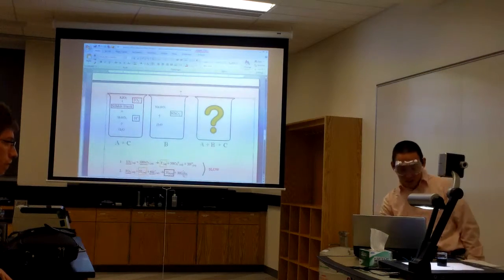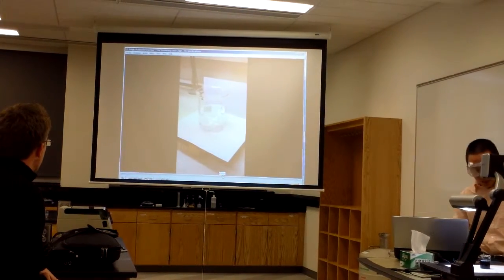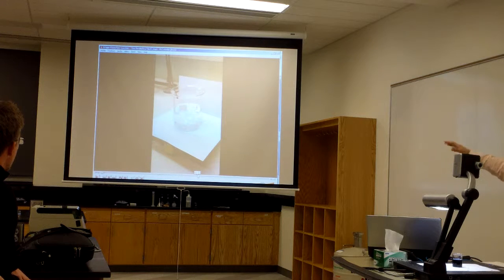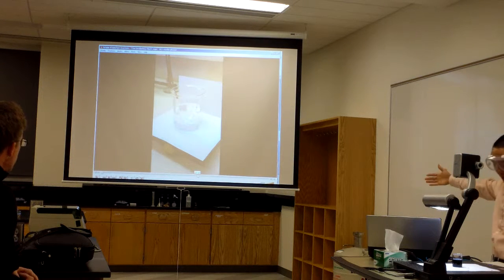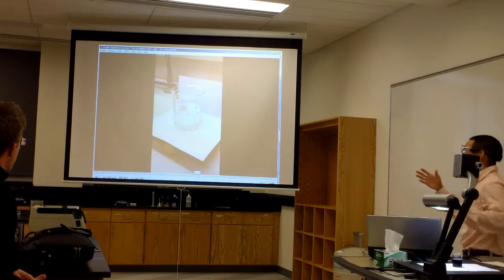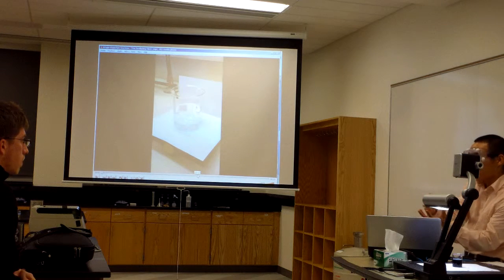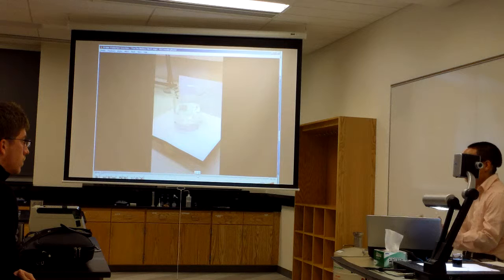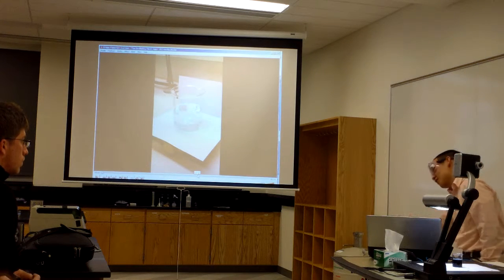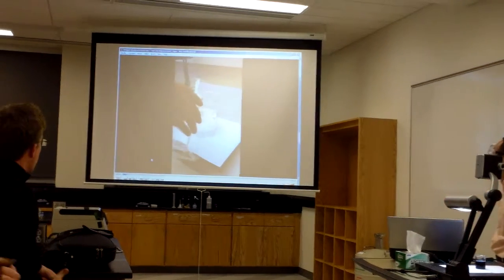And now there are alternative forms of this. This one here is called the Briggs-Rauscher version, and this one's called the oscillating clock because it oscillates, obviously. And this one includes malonic acid, manganese sulfate, hydrogen peroxide. Basically one reaction creates these products, and the products of this are like another color. So it keeps oscillating back and forth, but the concept is still the same. Once that fast reaction runs out, the reaction finally stops, but it'll oscillate, which is another cool demo that you could do for your students.